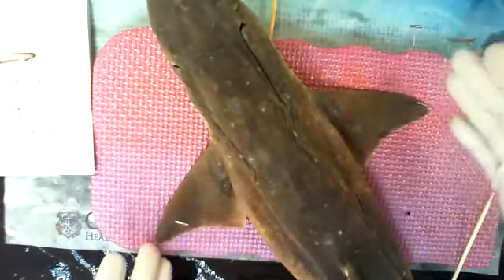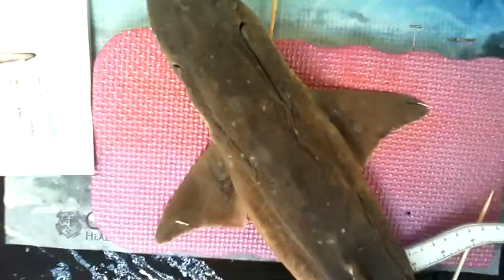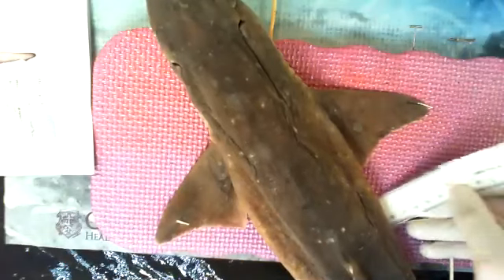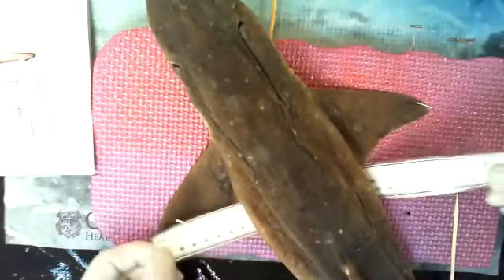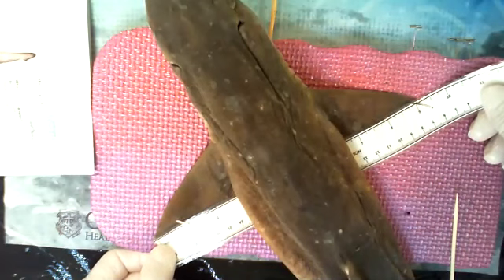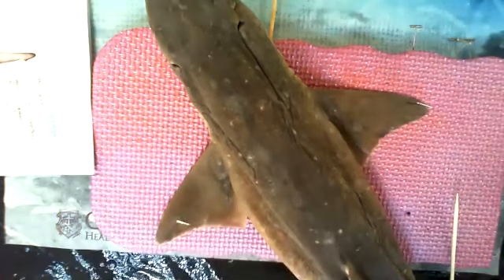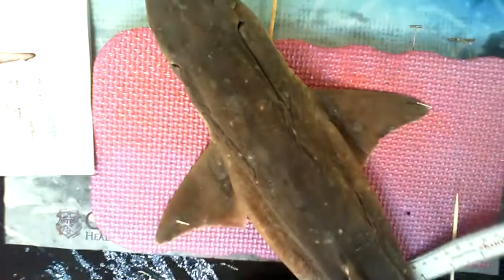So wingspan, you're going from tip of wing to tip of wing. You can do it with birds, you can do it with sharks, you can do it with airplanes, you can do it with us. We just don't have wings, but we still measure. If you hold your arms laterally as far as you can apart and you measure, that's your wingspan. I don't want to do inches. I like doing centimeters.